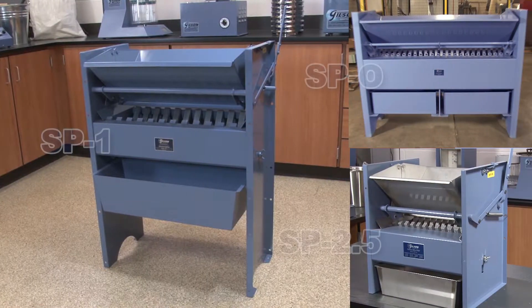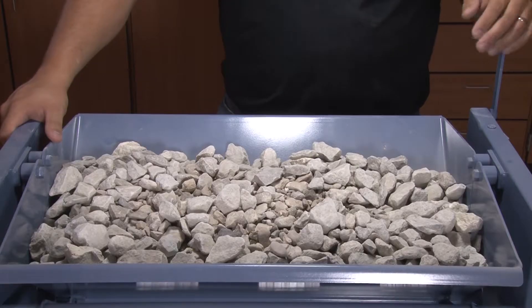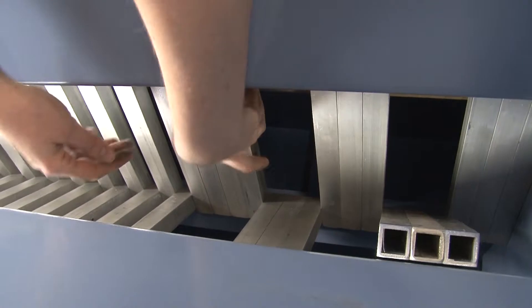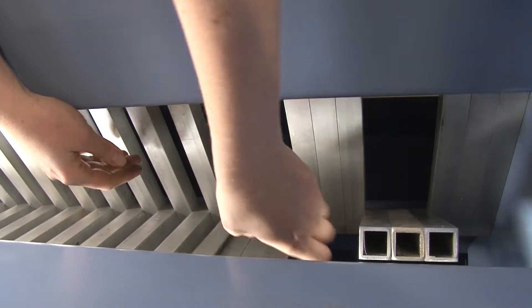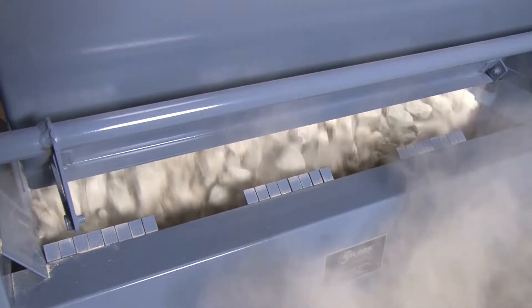Gilson's universal sample splitters are riffle-type splitters that feature Gilson's proprietary lever release hoppers and an adjustable width chute design, allowing for quick and accurate splitting of bulk samples into testing size specimens.